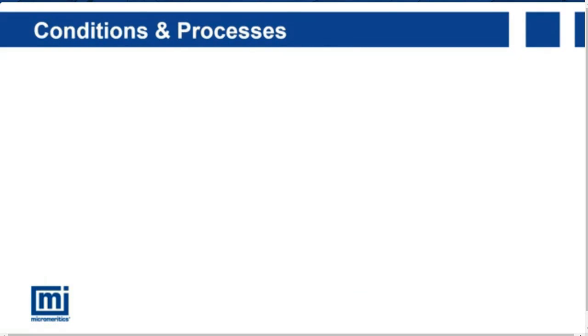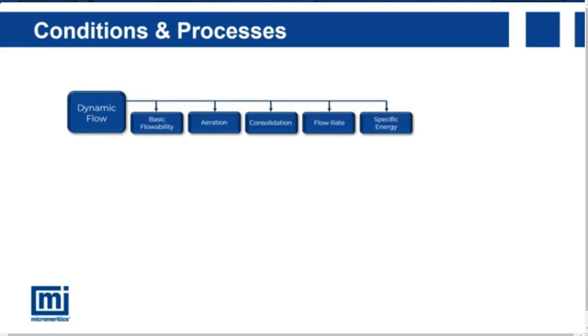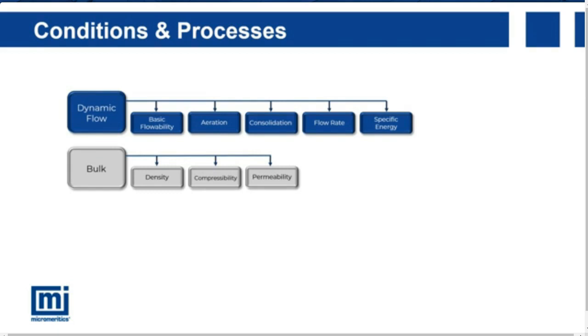The suite of tests available to powder rheometry is almost limitless, but as standard, three categories of testing are performed which provide a strong overview of a given sample's flow properties. Dynamic testing allows us to investigate the range of conditions in which powders are under high levels of motion and to examine a number of different flow regimes. Bulk testing, meanwhile, gives us an understanding of powders in a static state or when under exterior stresses across a range of regimes. By combining bulk and dynamic results, a rich data set with high quality information regarding not only powder flow, but particle-particle interaction can also be obtained.